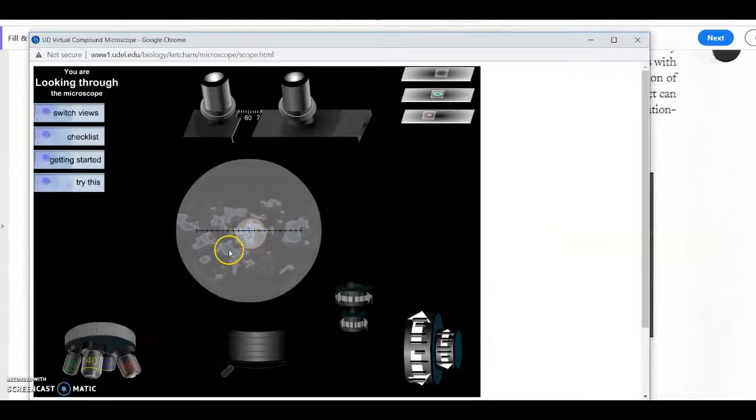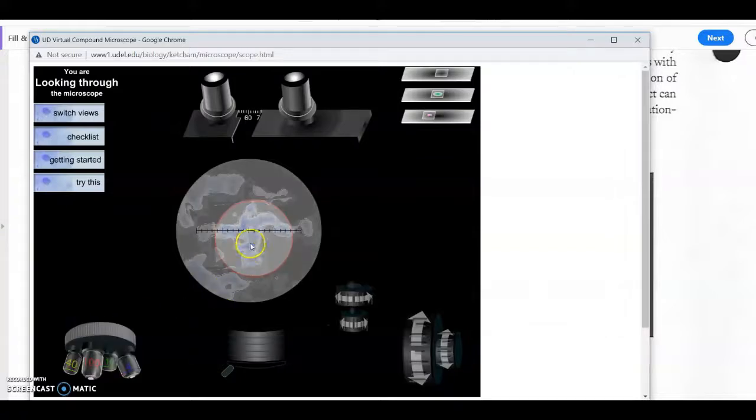These are human cheek cells, and that circle in the center reflects the cells that we're interested in. So at 40x magnification, so the objective here is 4, this is what you see. If you change the objective, you see cells better, but overall field of view decreases.